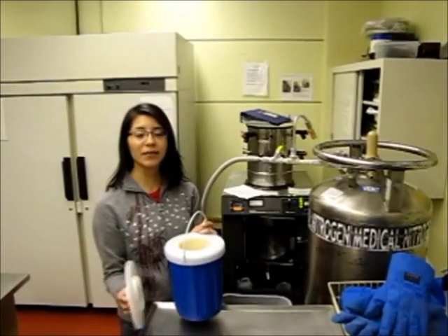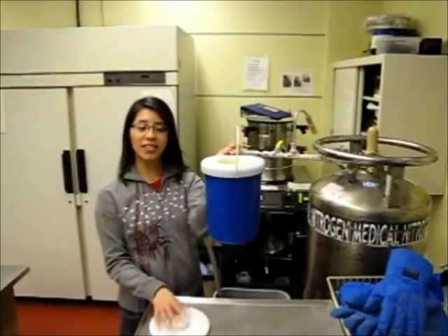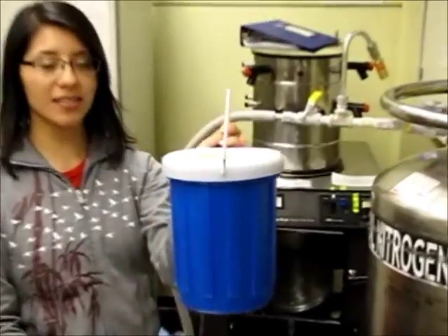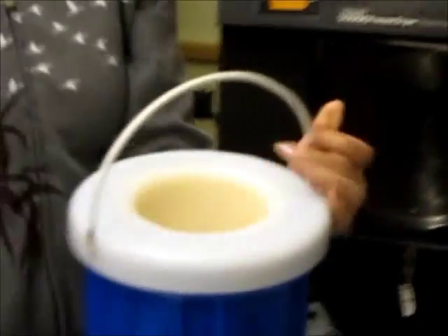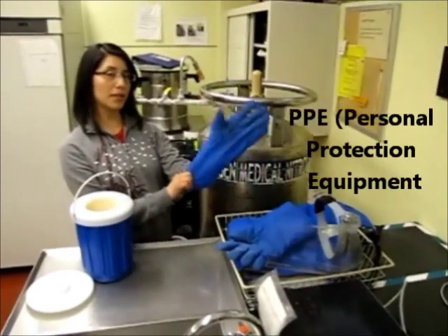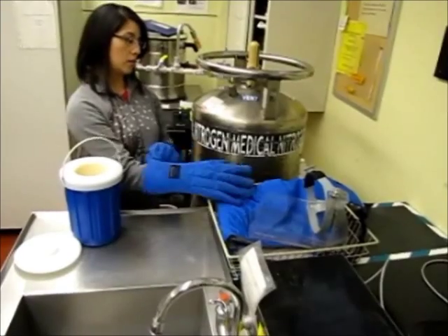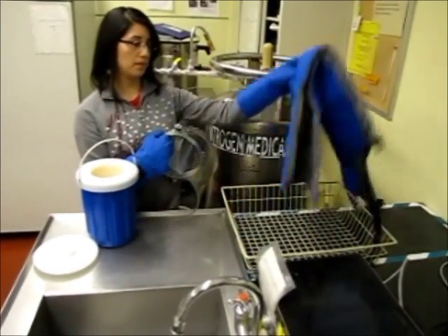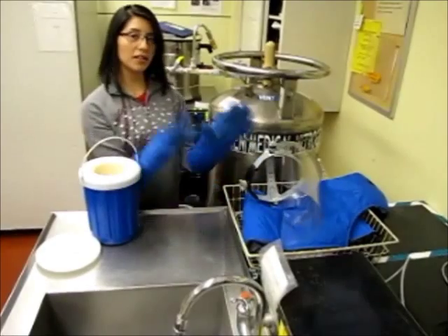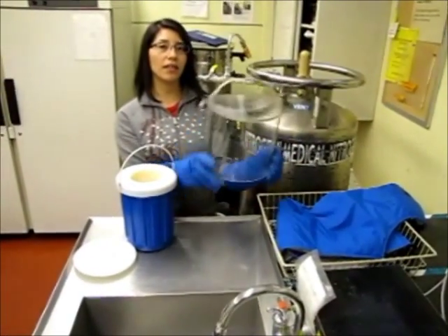We are now going to get some liquid nitrogen. Make sure you use a liquid nitrogen container that looks like this. Over here we have the protection equipment. We have gloves, a face shield, and an apron. I will be wearing the gloves and I will put on the face shield when I turn on the tank.